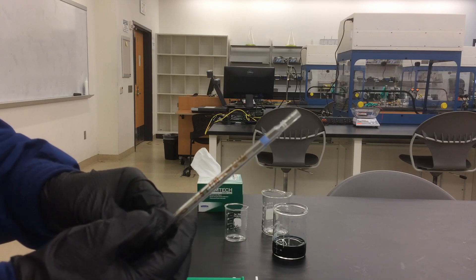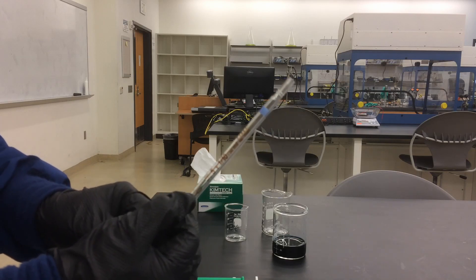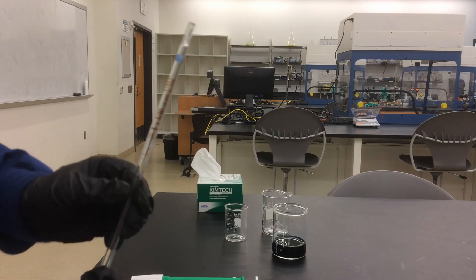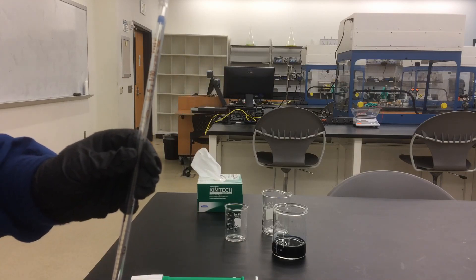Notice the markings start at zero at the top, and increase down the length of the pipette.